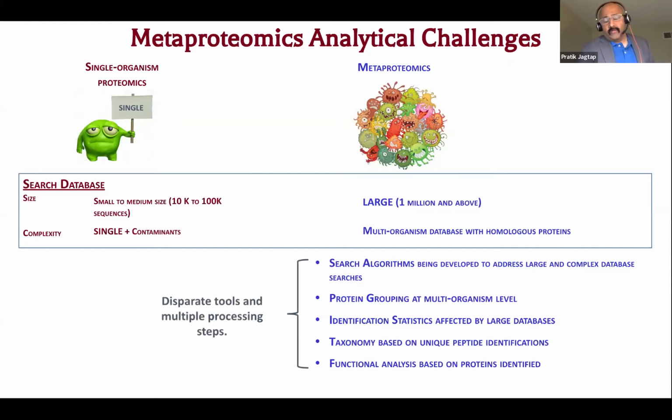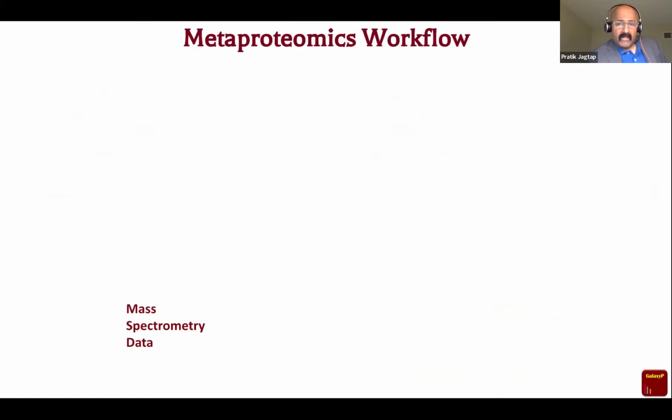In order to handle these multiple problems, and the multiple tools that are required for this, we decided to use the Galaxy platform. It basically helps you put multiple tools together and generate a workflow, and hence perform an end-to-end analysis wherein you can provide an input and you get an output at the end of the workflow. I'll just very briefly give an overview of the methods that are used.